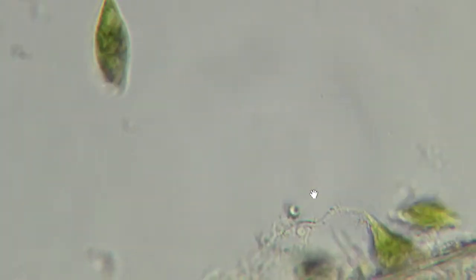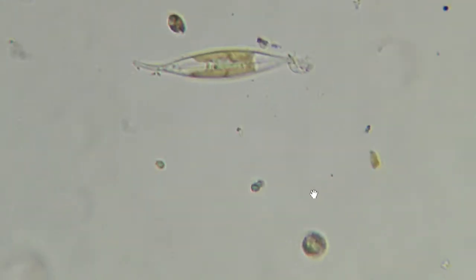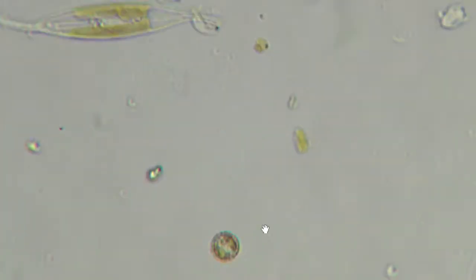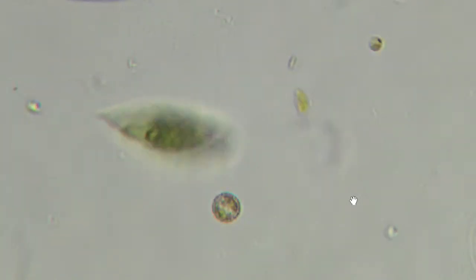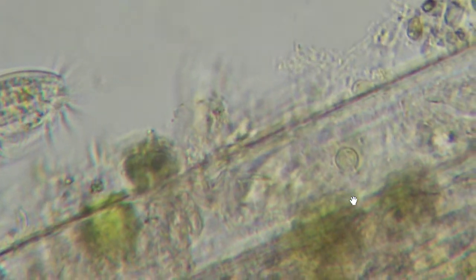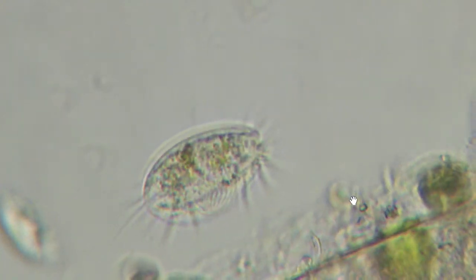Not bad. Where's that guy again? I want to get some more footage of the squishy one. There's a nice diatom. There's that little spherical one with the little studs on the margins again. I have no idea what that one is. There's your Euplotes again. Do your walking. Just a cute little guy.